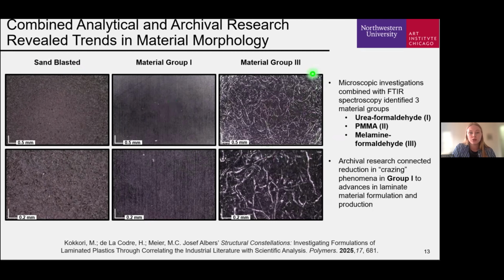Material group 1 has a smoother, more pristine surface commonly associated with Formica or laminate materials. However, material group 3 has fibril or void-like features across the surface. A comparison of FTIR with microscopy found that all works with this fibril or crazing-like phenomenon were melamine formaldehyde, in contrast with the smoother, more pristine surfaces in group 1 that were urea-based.